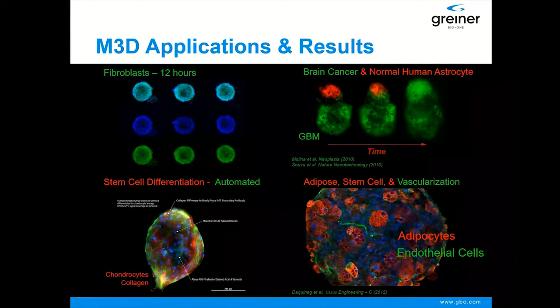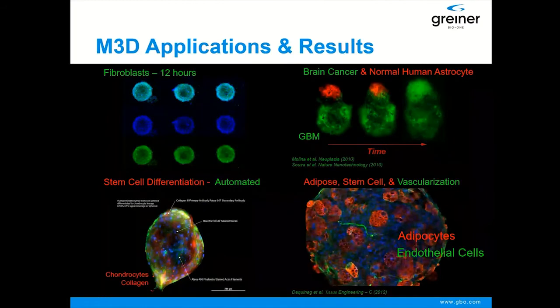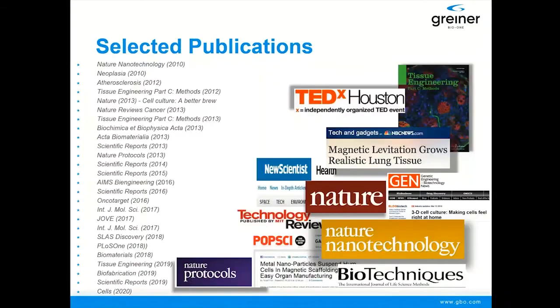For us to actually see the endothelial phenotype, we had to titrate the number of cells down to 95% pre-adipocyte stem cells and 5% endothelial cells. That's very important because in 3D cell culture, in more complex environments, when you want to co-culture different cell types, you have to optimize to achieve your desired phenotype. And that's what we can do with magnetic 3D cell culture. We can help the manipulation and optimize your experiment the way you want.